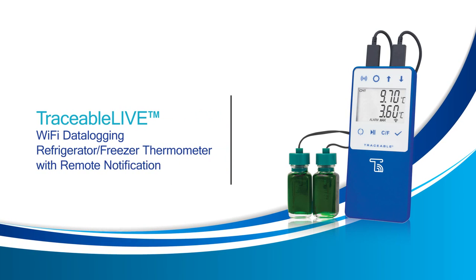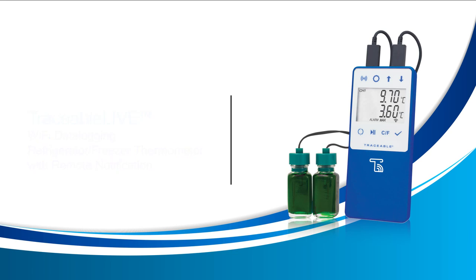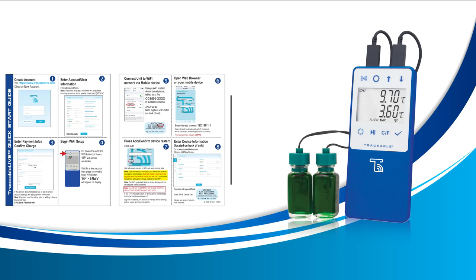Welcome to a TraceableLIVE instructional video for the TraceableLIVE Wi-Fi data logging thermometer with remote notification. In this video, we'll be following the quick start guide that came included with your TraceableLIVE device. Just like the quick start guide, we're going to divide this video into 8 small sections.